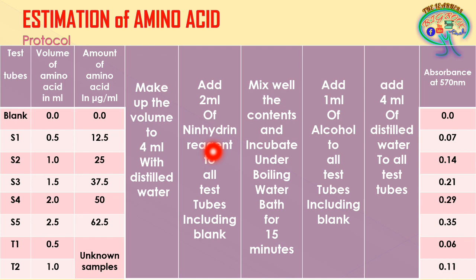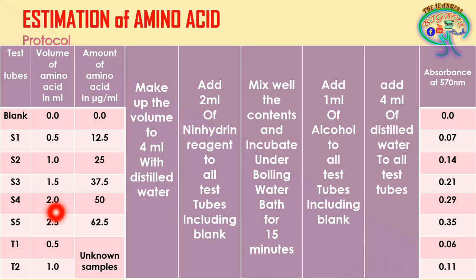Add 2 ml of ninhydrin reagent to all test tubes including the blank. The blank now contains only 4 ml distilled water and 2 ml ninhydrin reagent. Mix the contents well and keep under a boiling water bath for 15 minutes incubation. Then add 1 ml of alcohol (the diluent) to all test tubes including the blank.